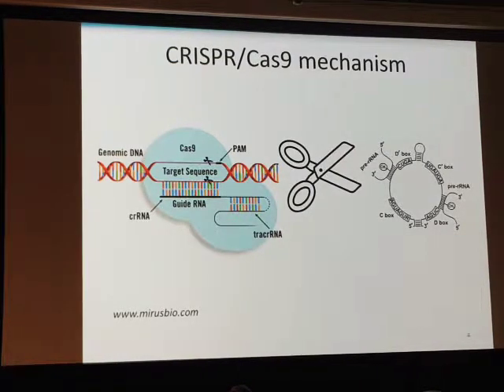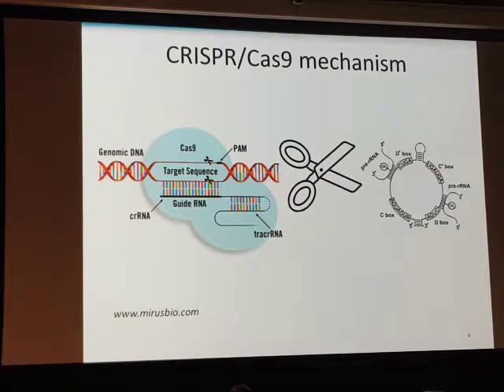And since snoRNAs have a lot of different structural elements, and depending on the presence and location of the PAM sequence in the snoRNA sequence, double-strand DNA breaks can be targeted at various elements of snoRNA. And the obtained cell lines can be further used for the functional study of snoRNAs in human cells.